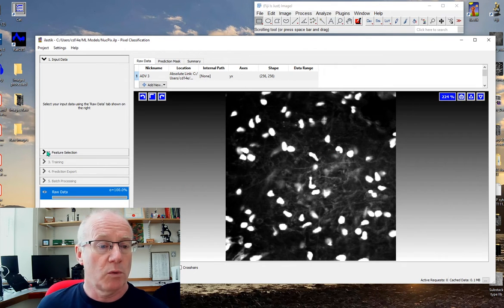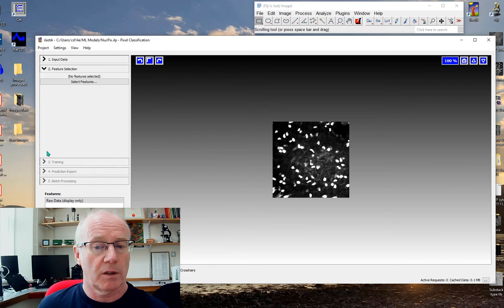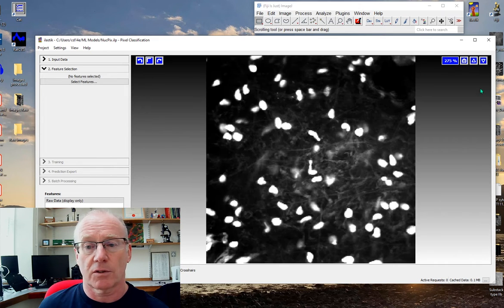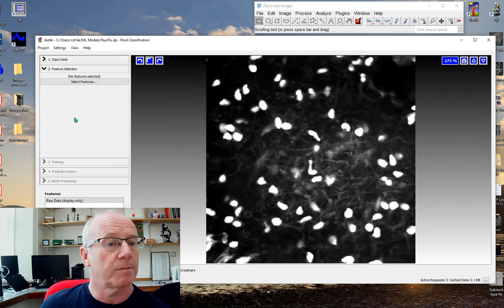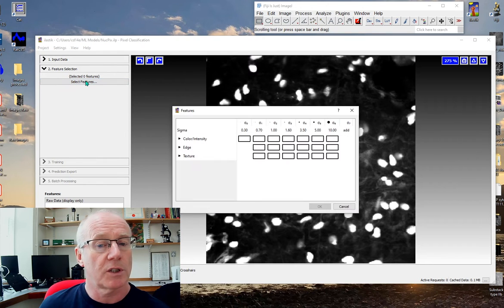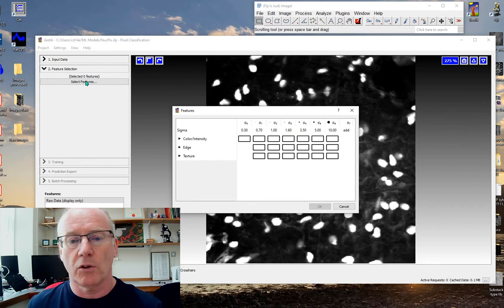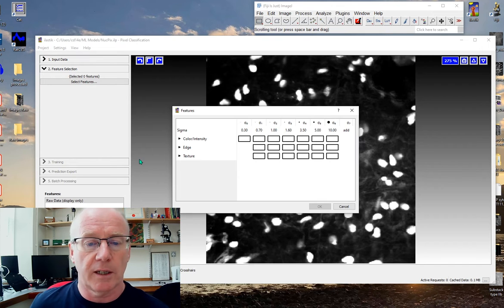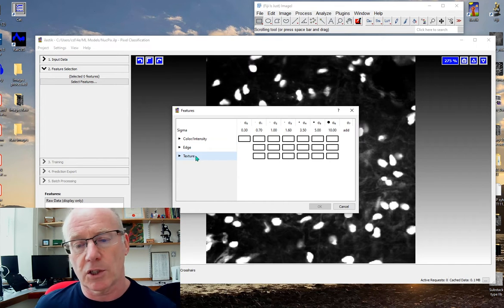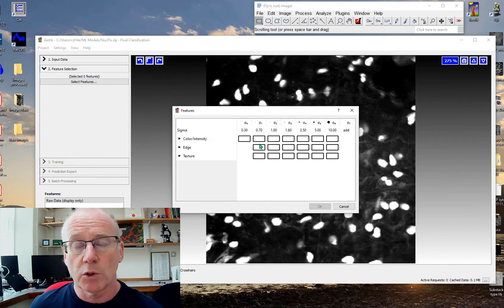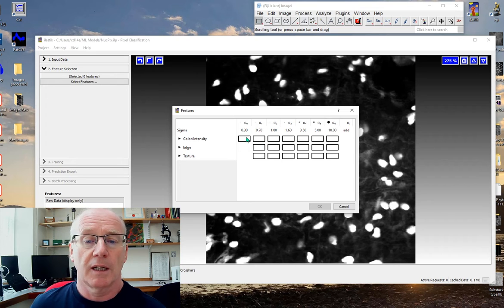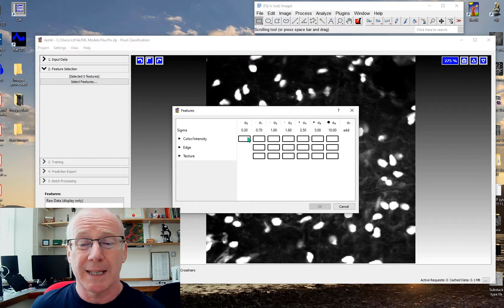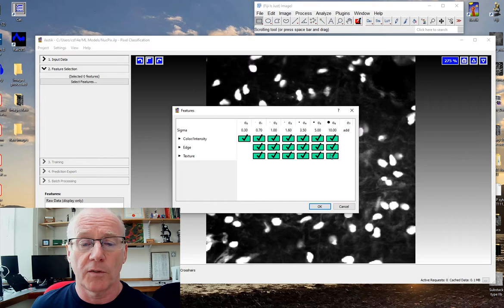We'll use a feature selection option next. Let's zoom this up and select the features. Ilastik can use color and intensity, edge detection filters, texture filters at different resolutions. We'll not go into that in detail today other than just select all of the features.